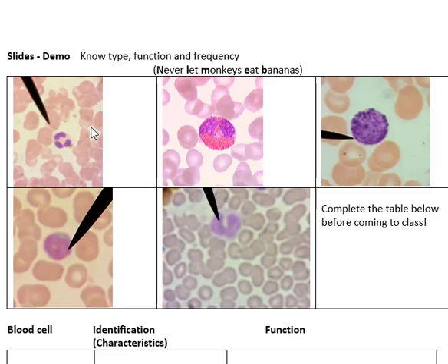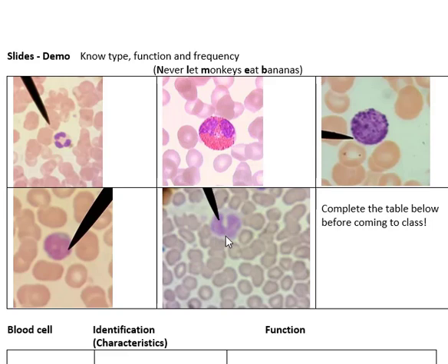Don't get leukocyte confused with lymphocyte. Lymphocytes are very easy to confuse with monocytes. They are actually very distinctly different — the monocyte looks like a telephone receiver and the lymphocyte looks like a blob filling up almost the entire cell. But look carefully at the size of the red blood cells (erythrocytes) and compare them to the sizes of these white blood cells. The monocyte is going to be much, much larger — it's the largest white blood cell, more than double the size of the erythrocytes.